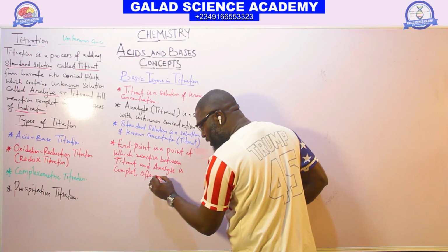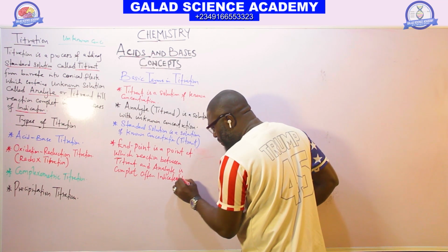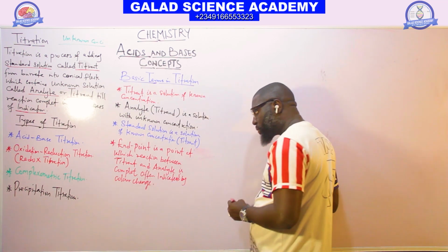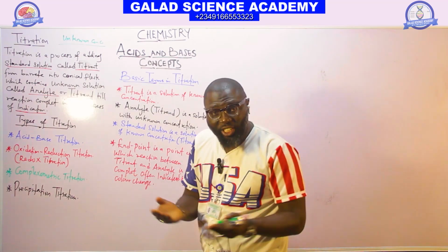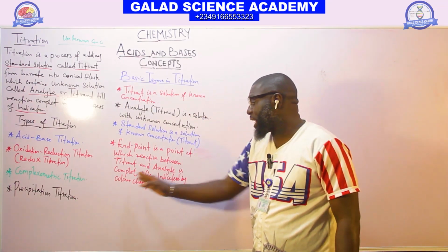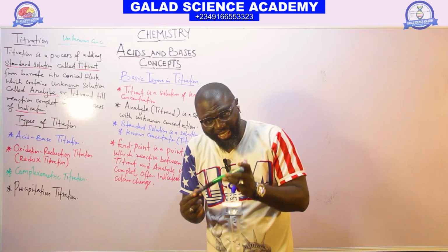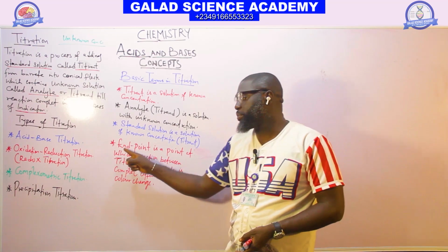Often indicated by color change. So the point at which the reaction between titrant and analyte is complete, we call it end point.